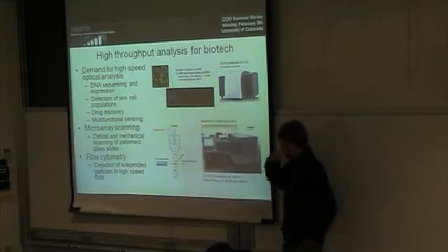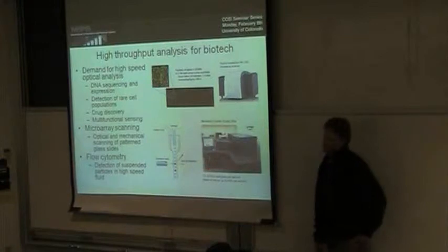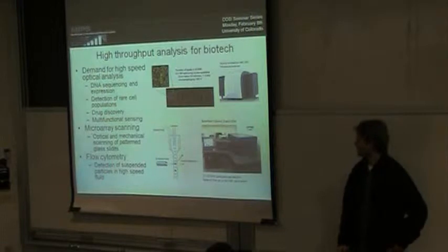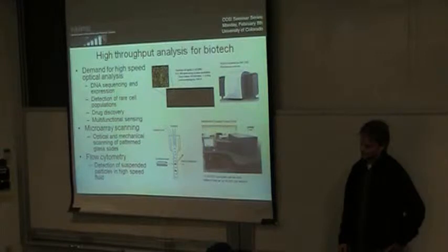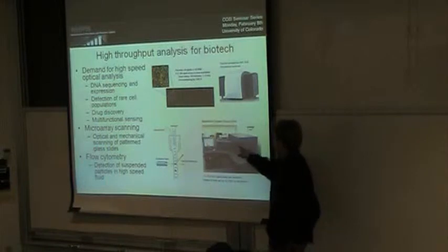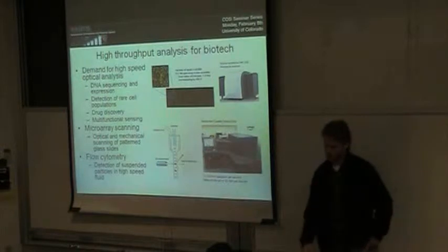There are different optical signals that you can measure. You can measure the forward scatter, side scatter, but the most common data is often just fluorescence. Sometimes you can measure as many as several fluorescent colors using a combination of dichroic filters. Here's an example of a flow cytometer. It takes up an entire bench, so it's capable of this high throughput and is a very successful measurement platform. Our technique is very similar to flow cytometry, but we're going to read it out in a method that looks a little bit like those pictures of the microarray.